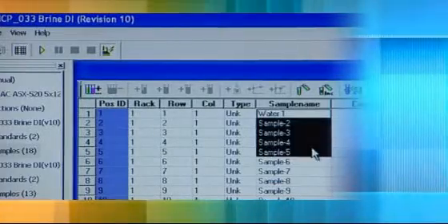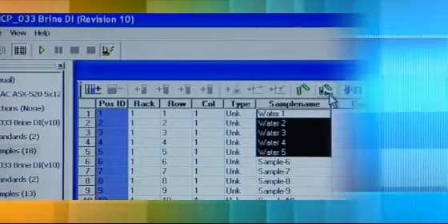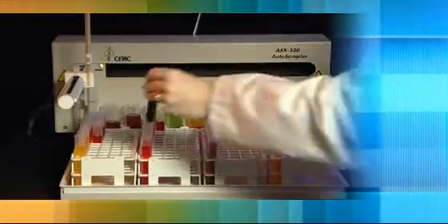This makes visualization of sample placement within racks easy. ITIVA allows the full manipulation of automated running sequences live.